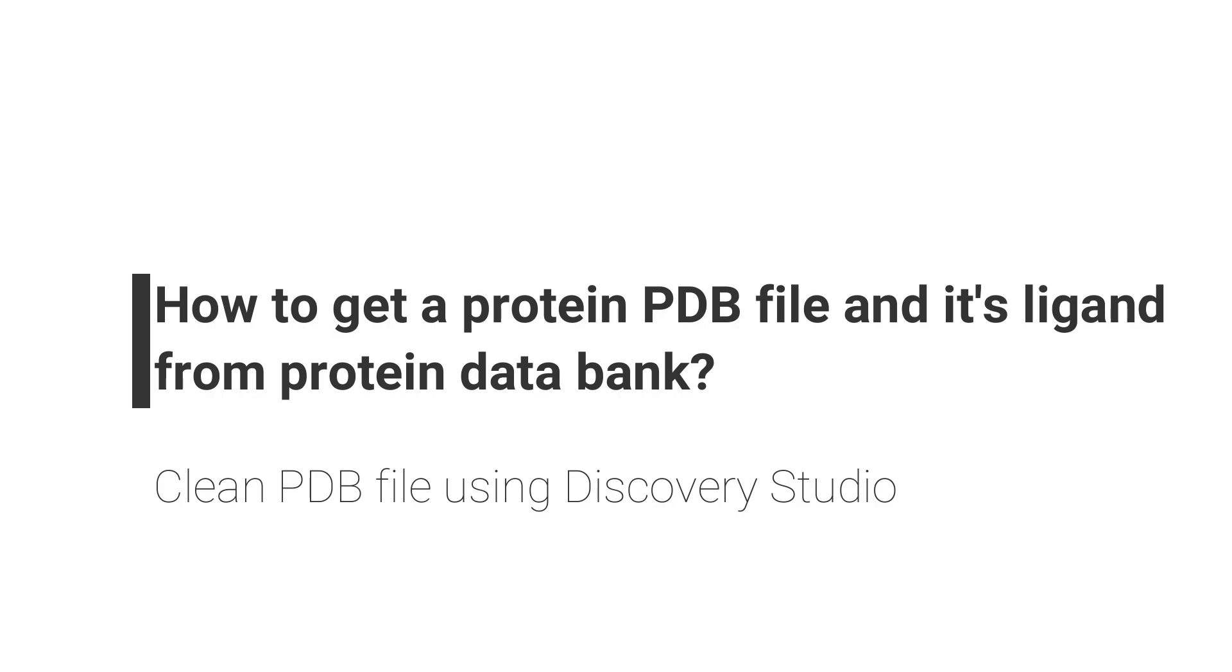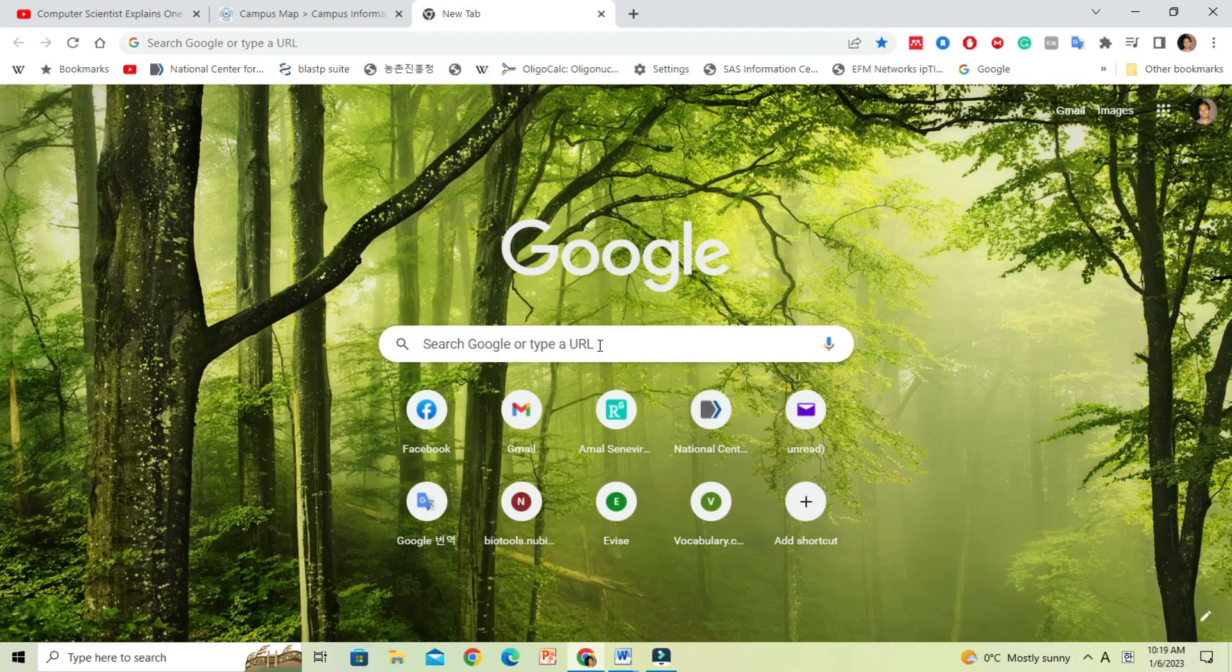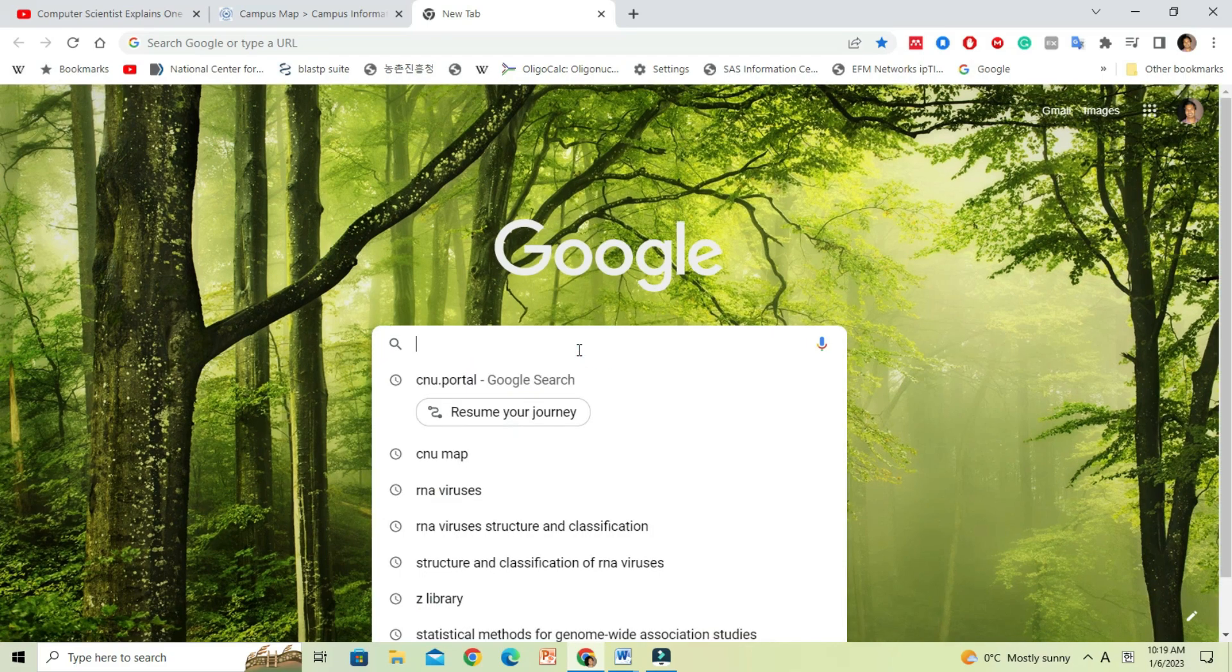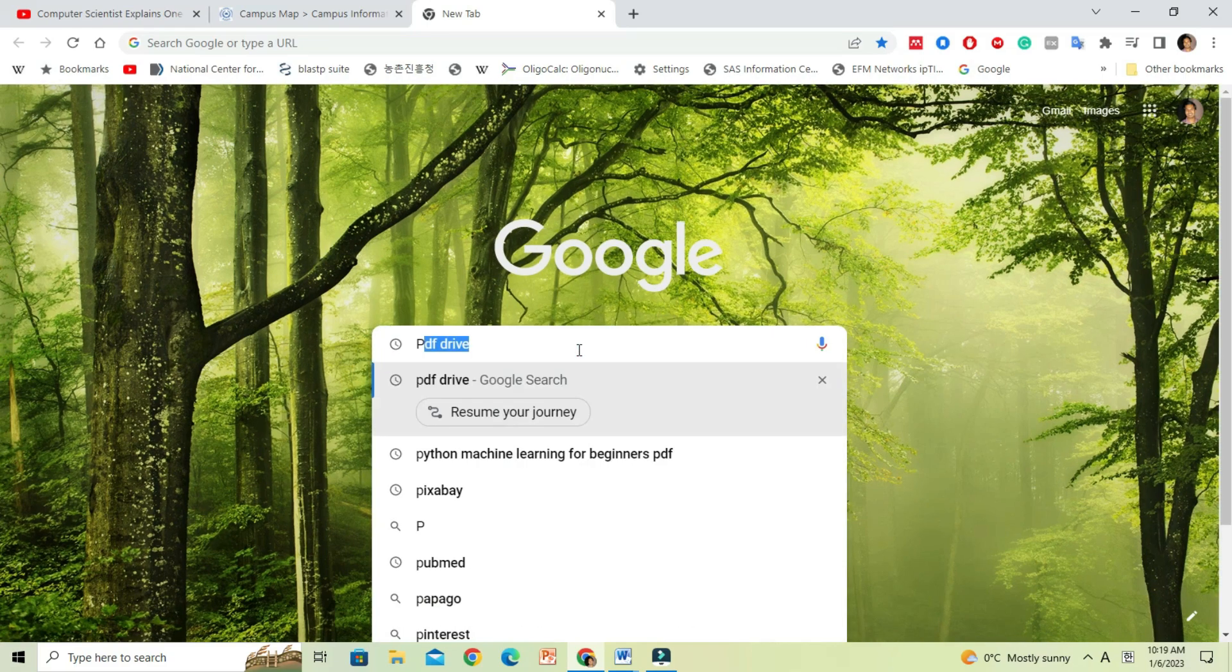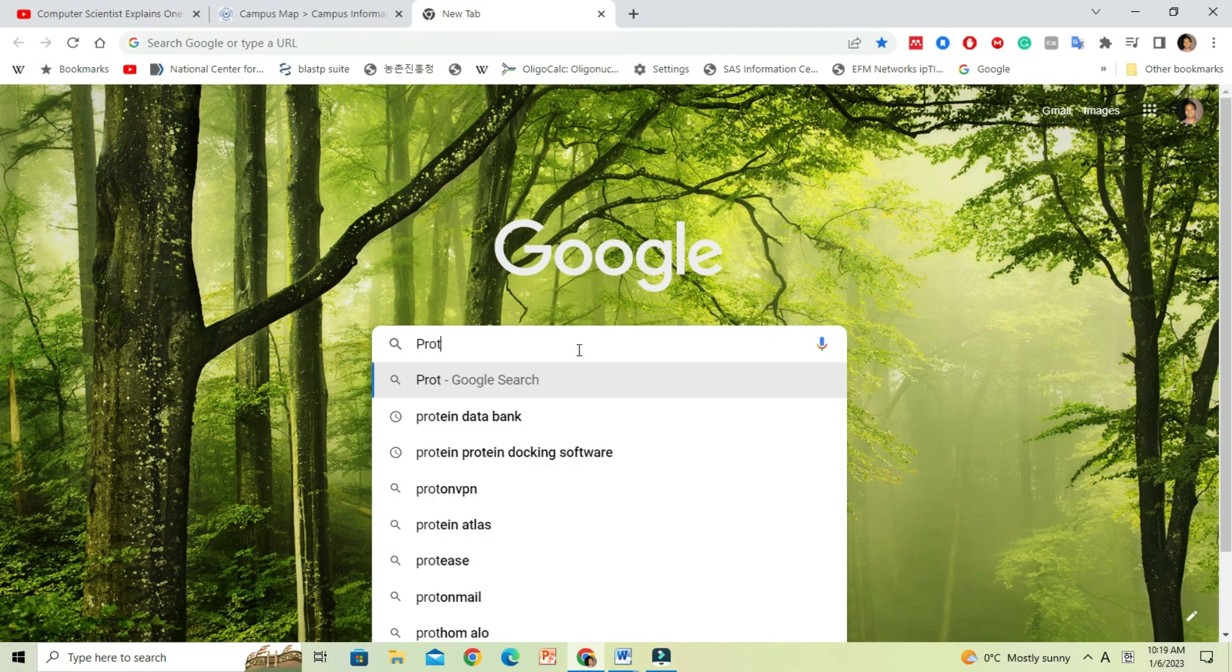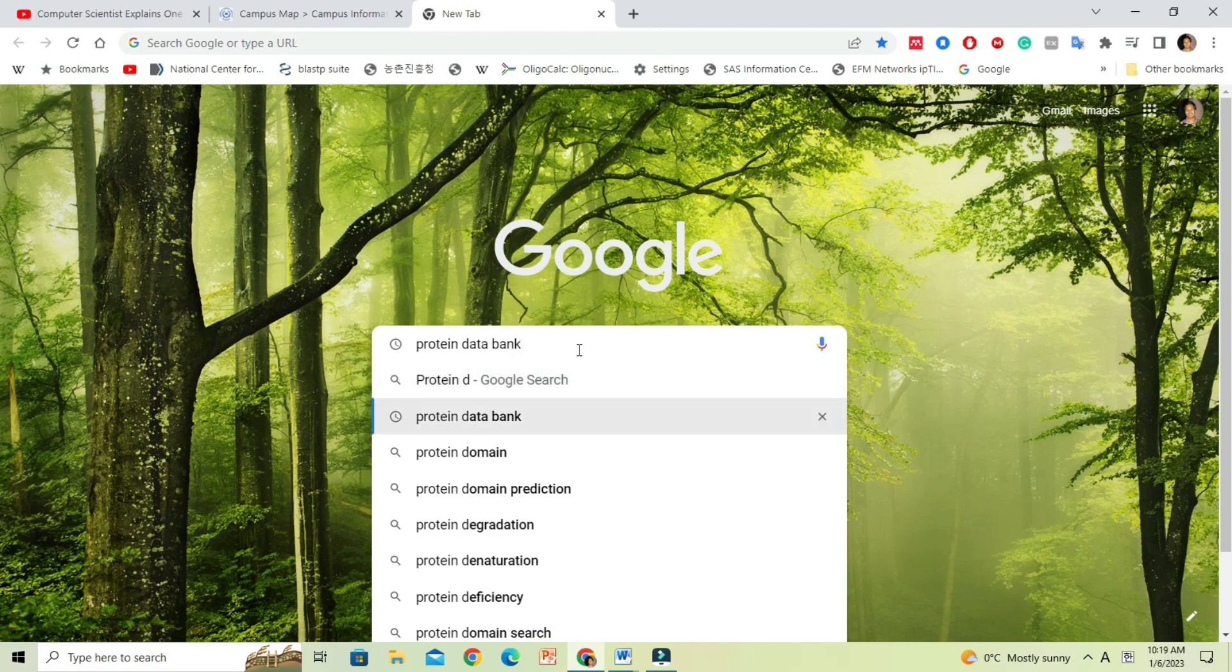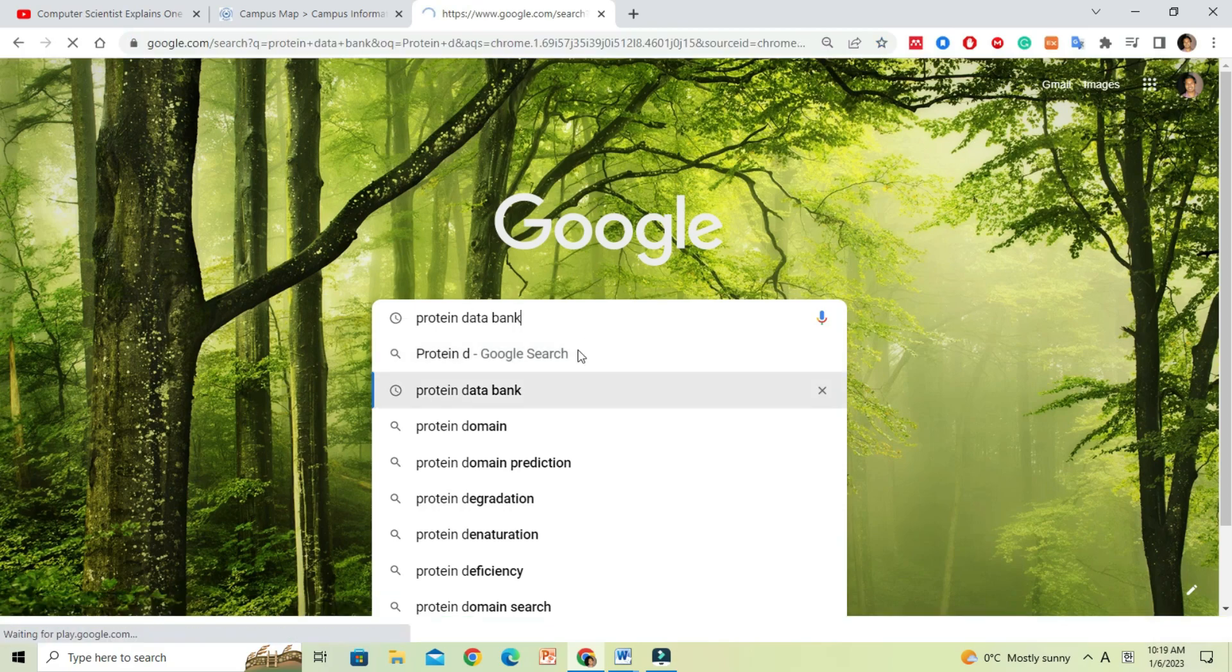Now, first we will go to protein databank. You can google it. Click on the link and we will be brought to the PDB website.